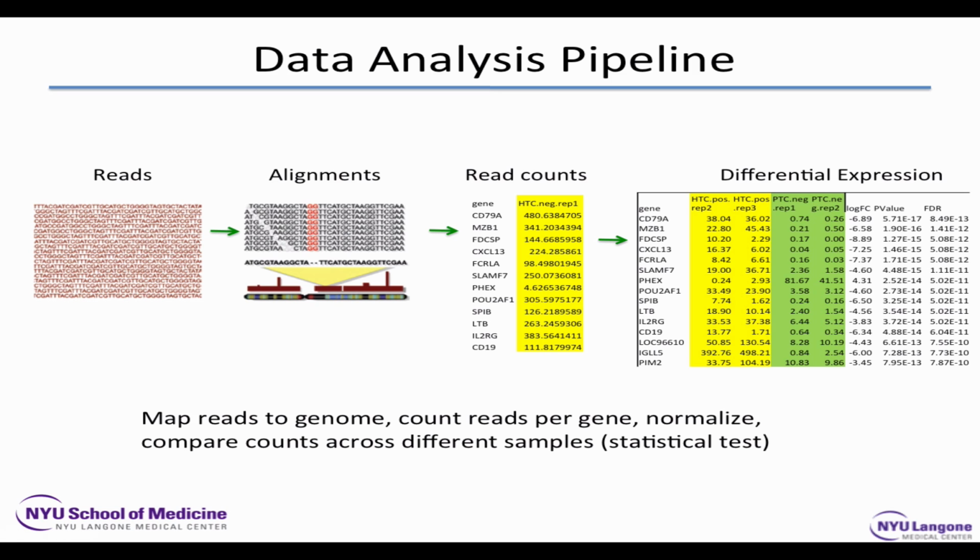Those aren't going to be particularly accurate when you have no replicates, but with a better experimental design, you have a moderate amount of trust in those corrected p-values to say, yes, this gene is differentially expressed, it has a fold change of this, and I have a confidence that that fold change is significant at this level. And of course, there's a lot of different statistical packages that compute those statistical certainties in different ways, and I'm not going to get into that debate today. We only have 2 hours.